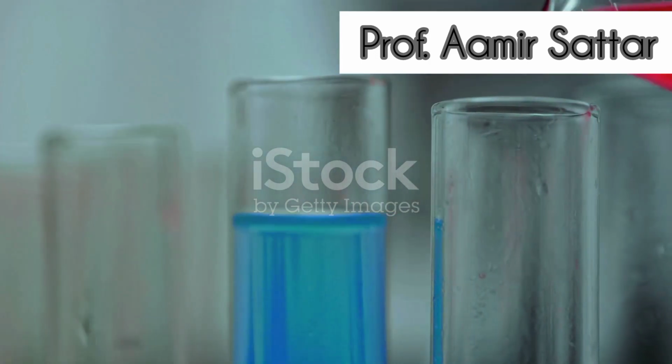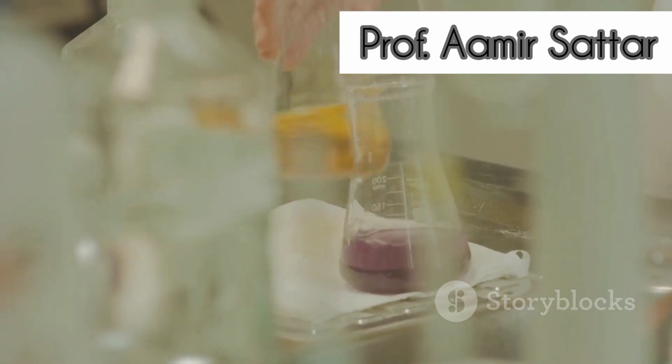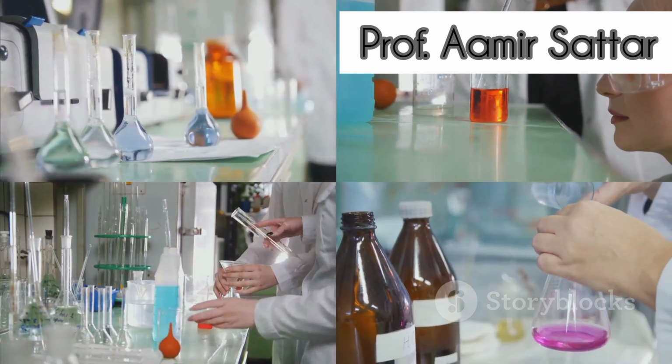The solubility test is straightforward. A food sample is mixed with chloroform or alcohol. If it becomes miscible with chloroform and immiscible with water, this confirms the presence of fats.